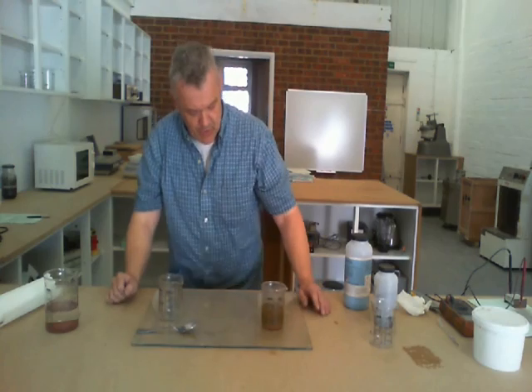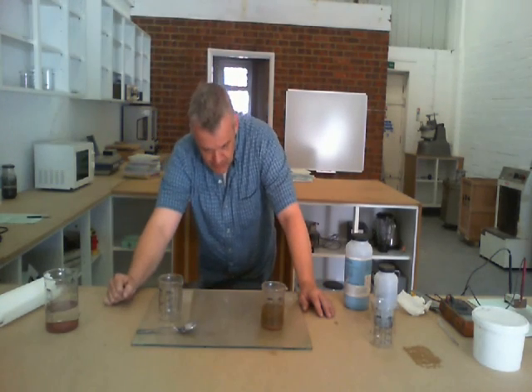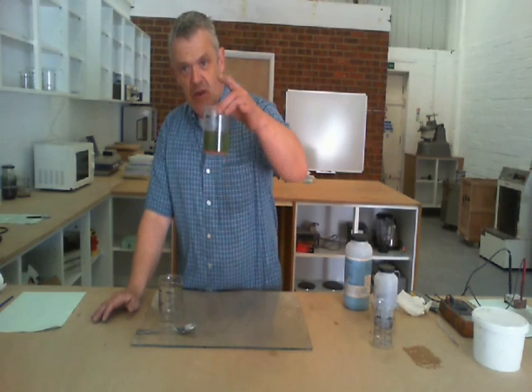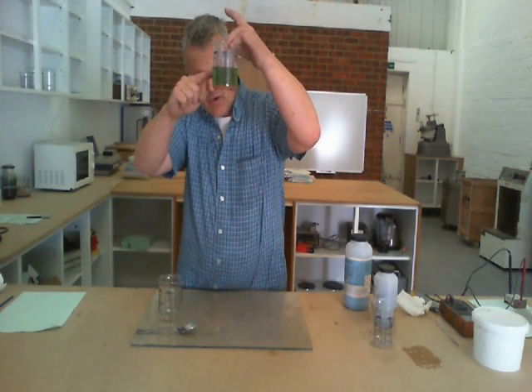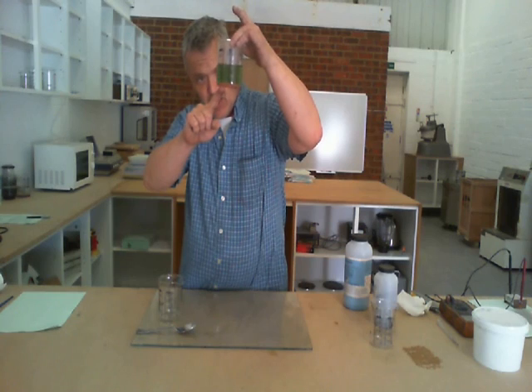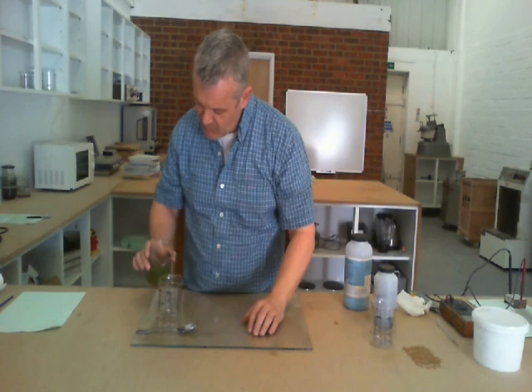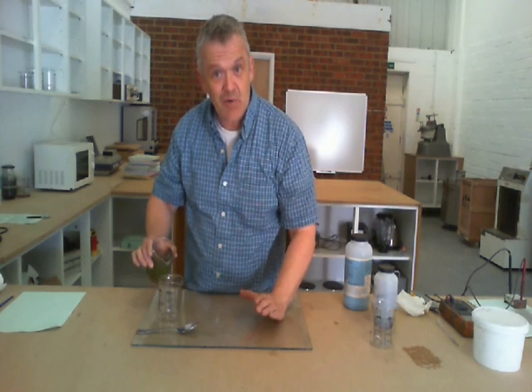Now we're going to leave that to settle out before we do the next bit. After leaving that to settle for a little bit, you can see that we've got quite a green solution here and then our layer of pink particles at the bottom. Now you know that's copper because copper is salmon pink and copper oxide is brick red.